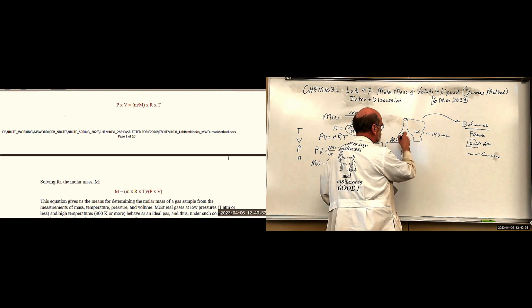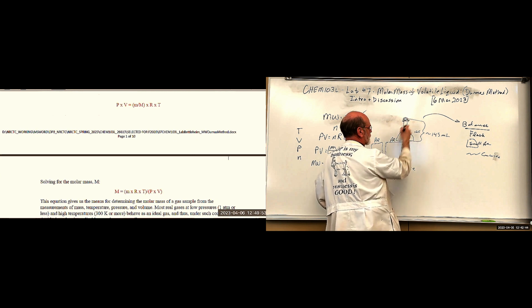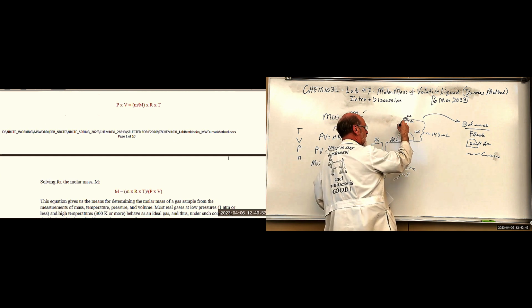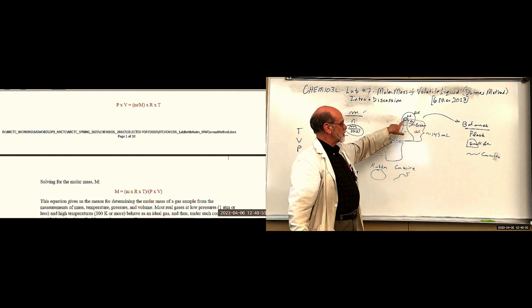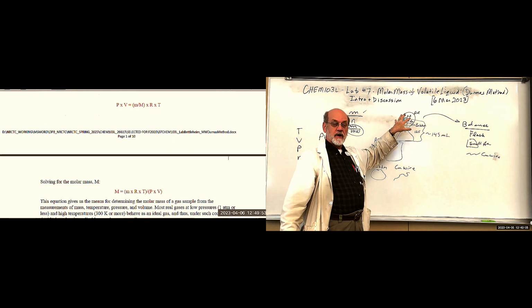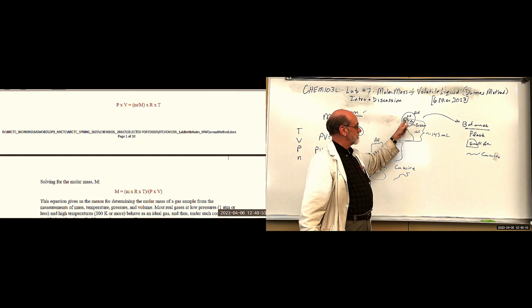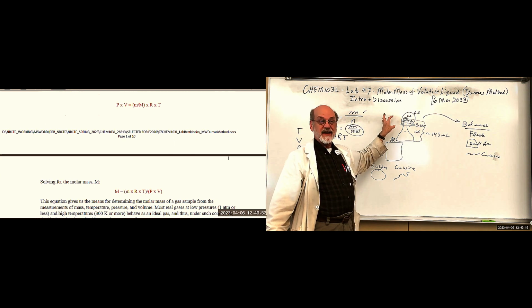Well, when you put the small sheet of aluminum on here and cinch it down with a copper wire, then you're going to cover that with a bigger sheet of aluminum with a rubber band. The reason you do that is you want to protect this part of the contraption from water condensation. You don't want water to get up underneath that one. So you protect it with this one. But it's not going to be weighed.